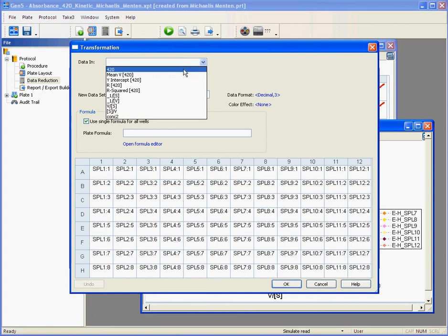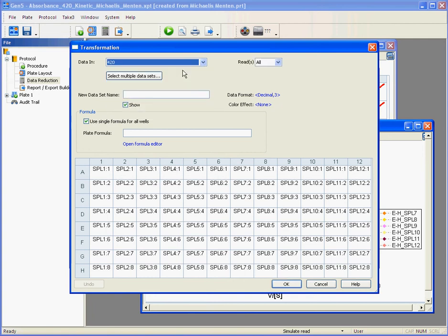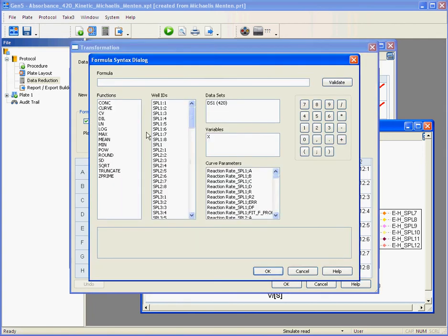I'm going to select a data set, open the formula editor, and what you can see right here is a list on the left of all the functions available in Gen5 that you can use to transform your data.